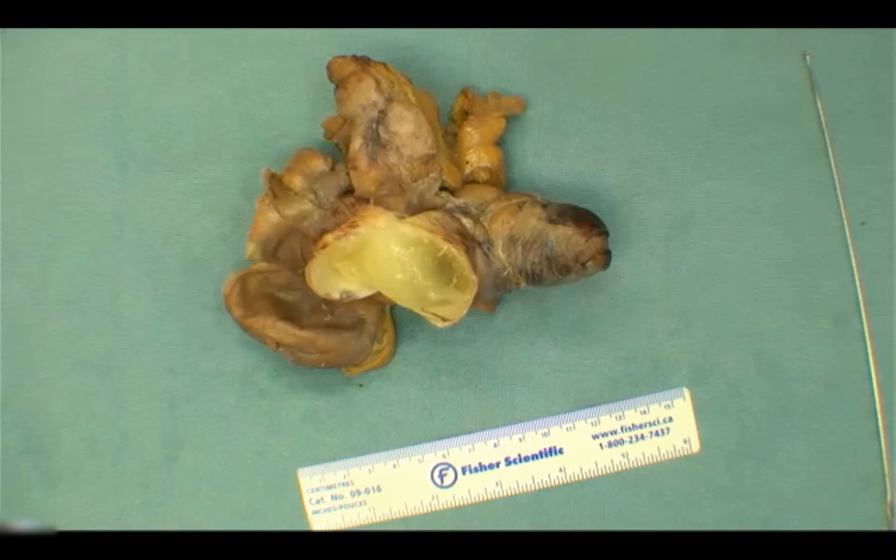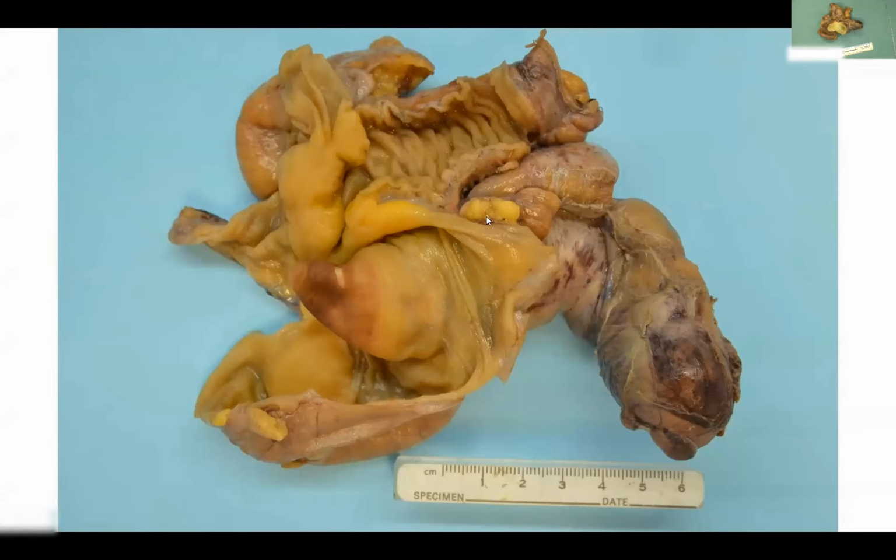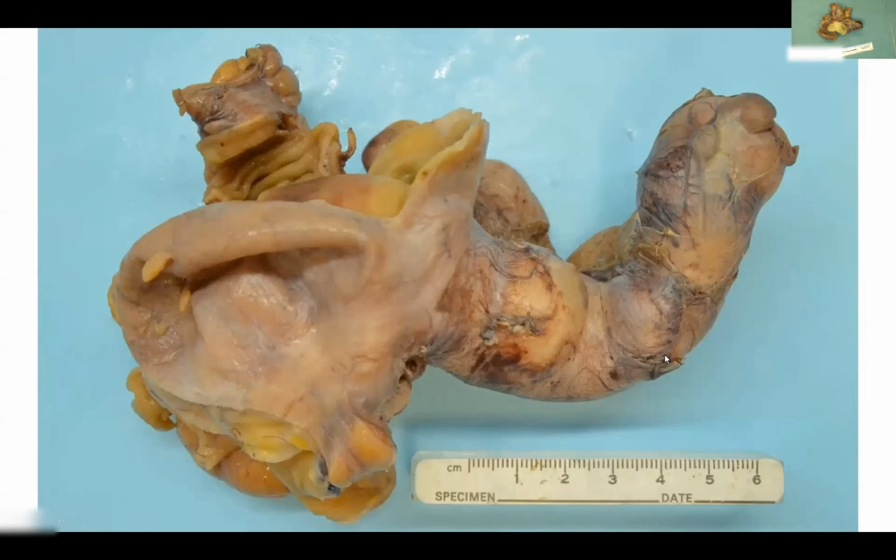Let me get through our summary. Here's our specimen, nicely photographed, just showing all this ileocecectomy, I don't know how to pronounce it, with the significant segment of terminal ileum there. You can see the IC valve here, as well as mucin protruding through. And then, of course, a dilated, elongated, and enlarged appendix. Here is the serosal aspect. What's important here are a couple of things.